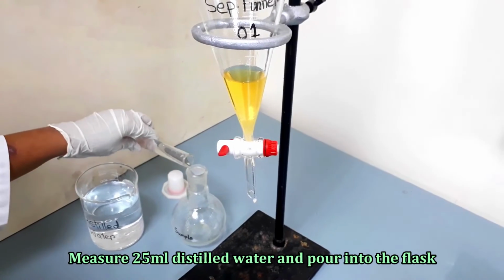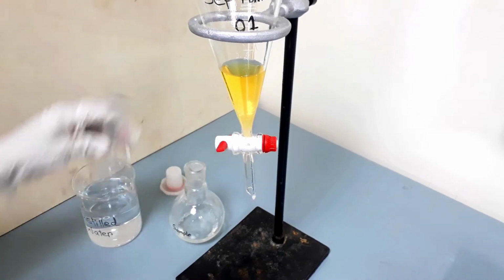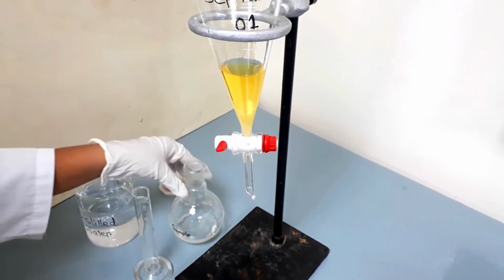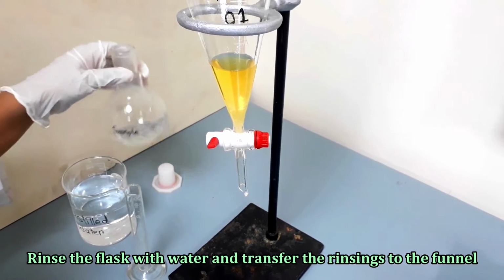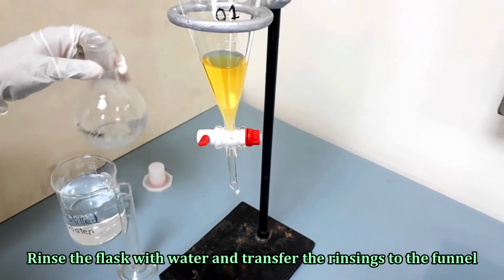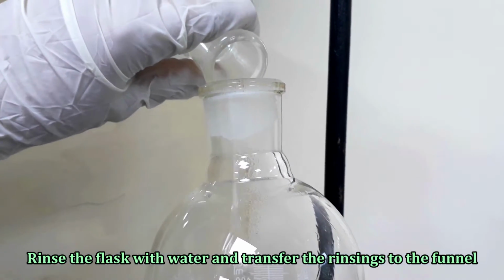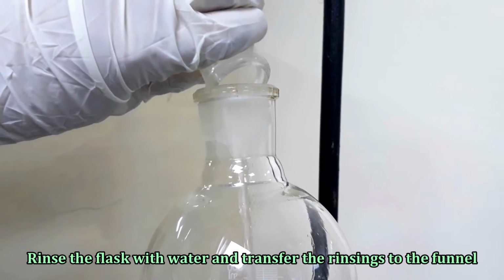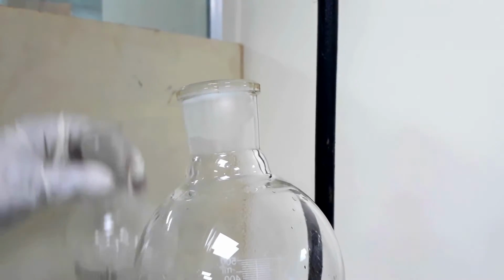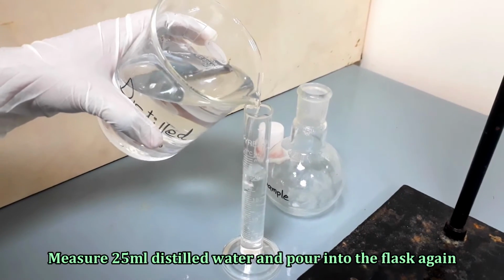Wash the flask with 25 ml distilled water and transfer the washings into the separating funnel. Wash the flask with water again in the same way.